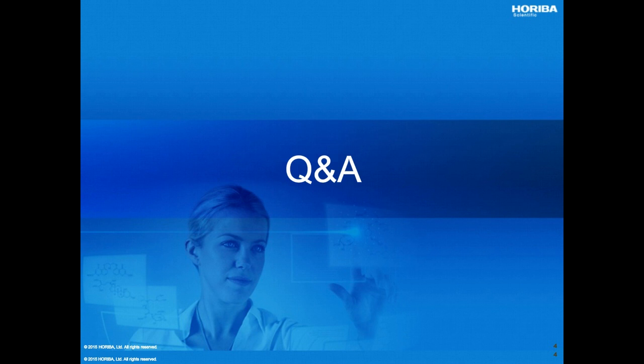Hi, thanks, Urban. That was a very informative webinar. We're almost out of time, so let me just say that we'll answer about 2 or 3 questions, and any others that we've gotten, we can send you an email with the answers. So the first question is, I don't want to use MATLAB since I don't have any experience with it. Are there commercial software packages that support data processing and modeling as well as data export in the right format so I can use OpenFluor?